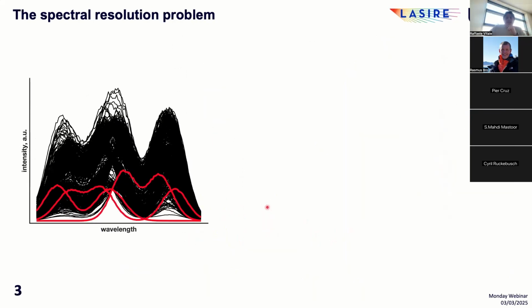Imagine that one has collected a series of spectral data on all possible mixture combinations of three different components. This means that the spectral profiles contained in this dataset can be underlain by a single pure component, a binary mixture of 2 out of 3 components in different proportions, or a ternary mixture of all the 3 components in different proportions. This is, of course, a simulated example, and for the sake of simplicity, here only 3 pure component spectra were accounted for, these ones highlighted in red.